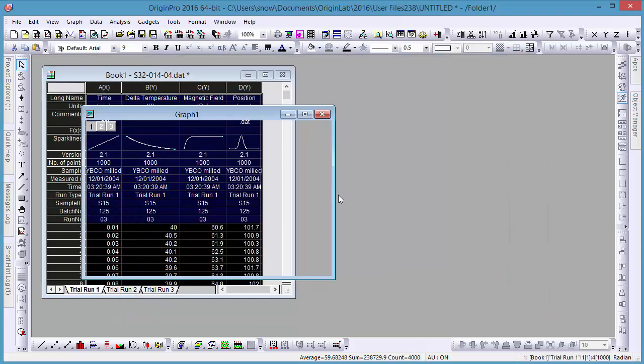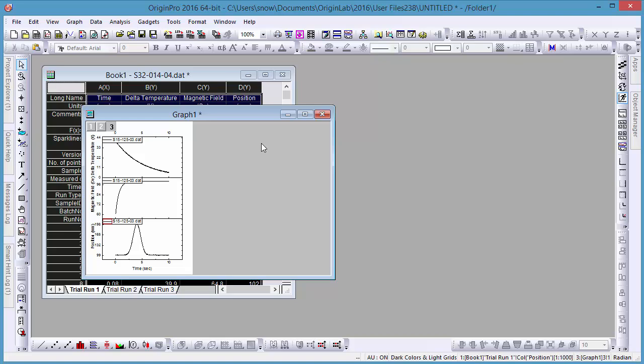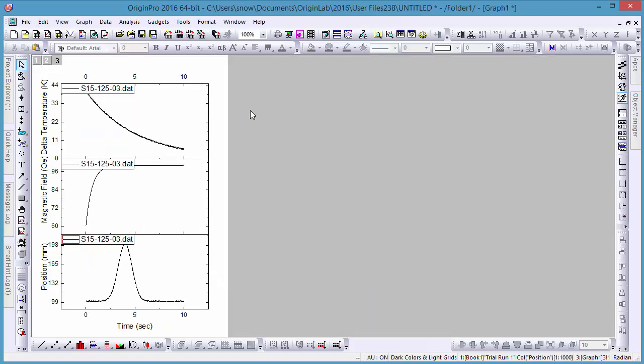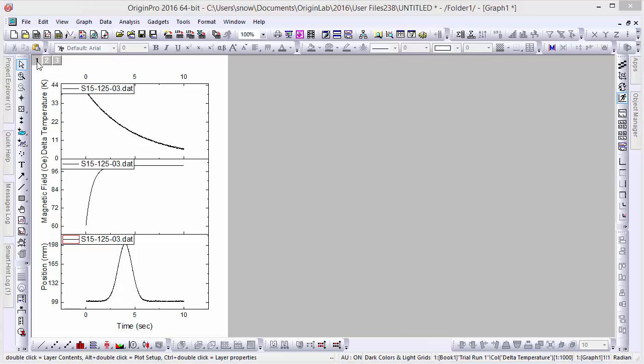To do so, go to the numbers in the top left corner of the graph window and double-click on number 1 to open the Layer Contents window for that graph.